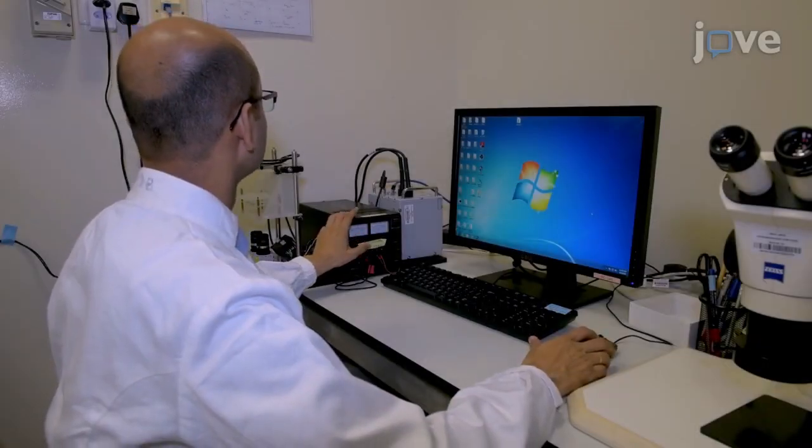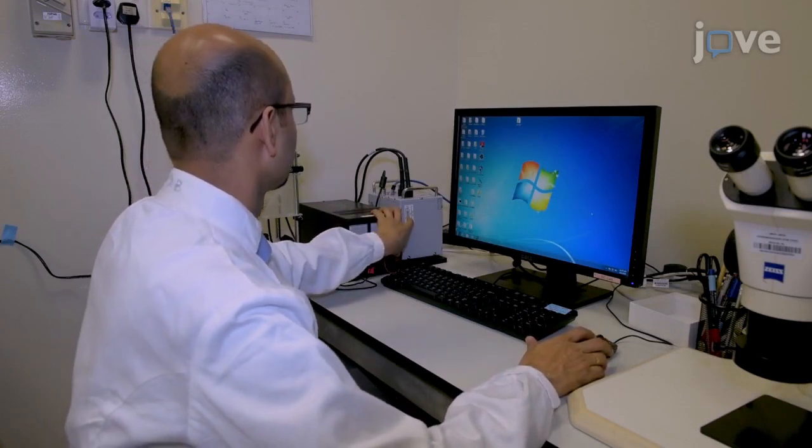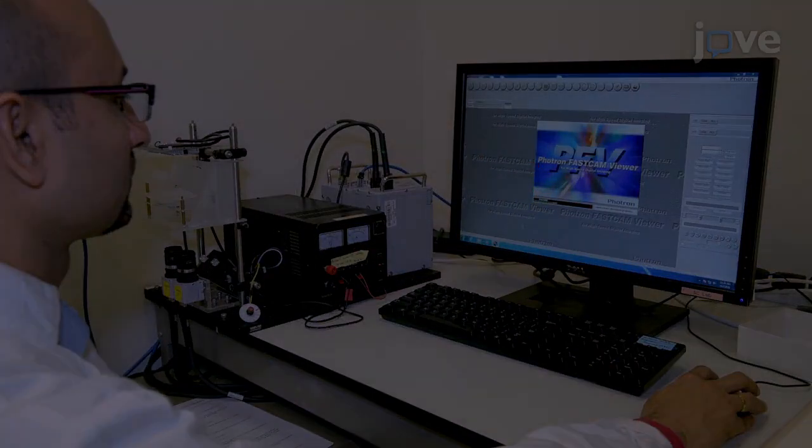To generate videos for FLLIT analysis, first turn on the power source and open the viewer application on the connected computer.